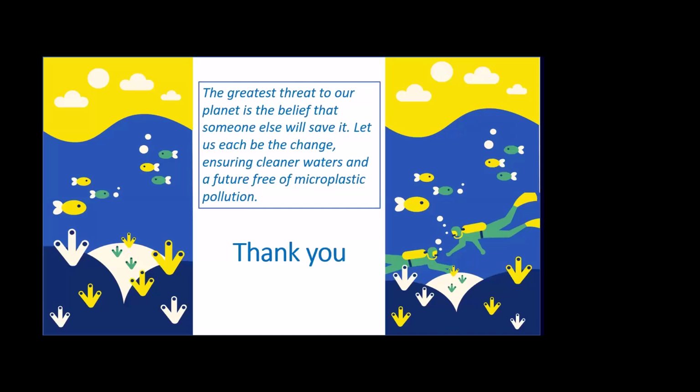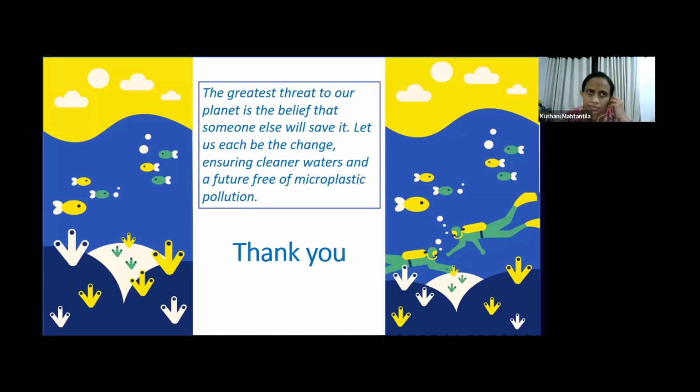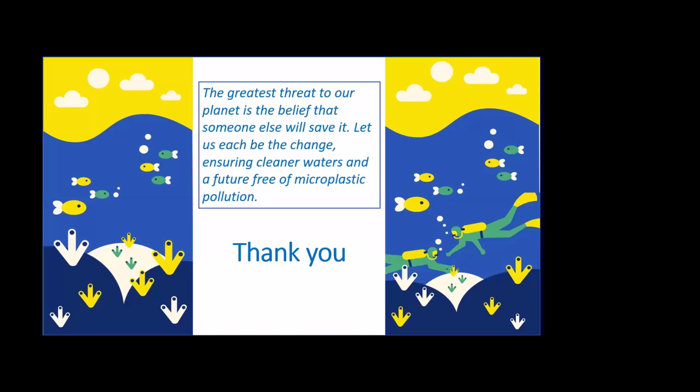You can test with a particular microplastic type, but in the UV, since there can be scattering as well, you can test it with a scanning procedure and get a peak in the UV spectra, but that is not really a standard method.